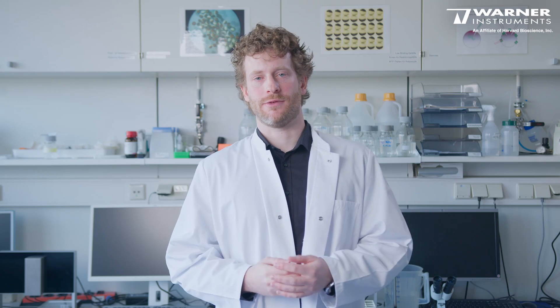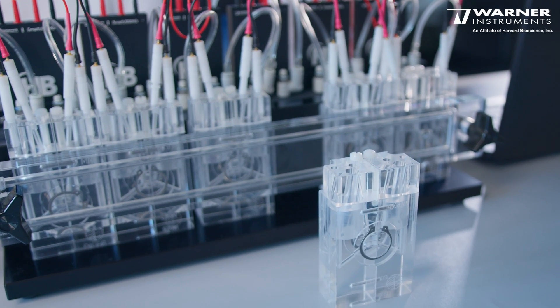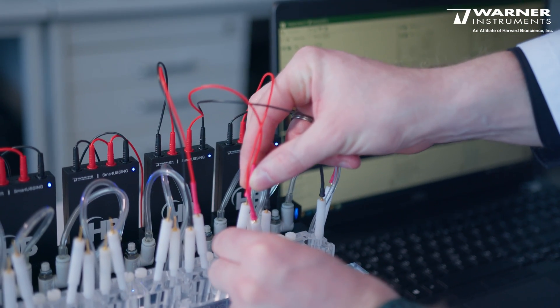You can also upscale by buying several units of the Smart Ussing system and attach them to the same computer. We offer a range of different chambers for different tissue sizes and cell cultures, and the chambers and their electrodes are reusable and will last for a long time.